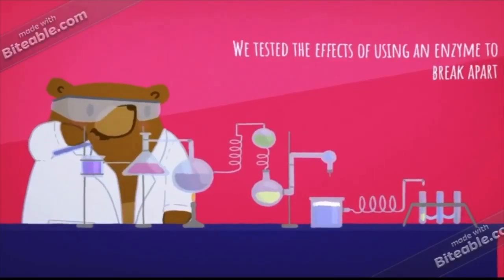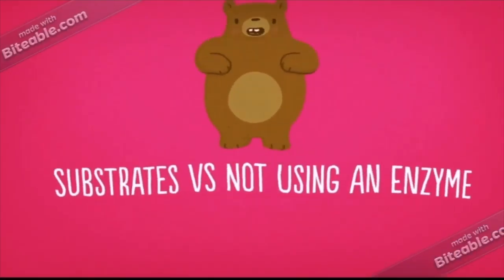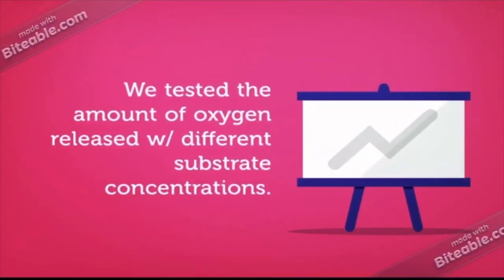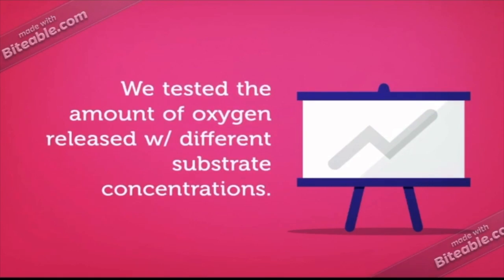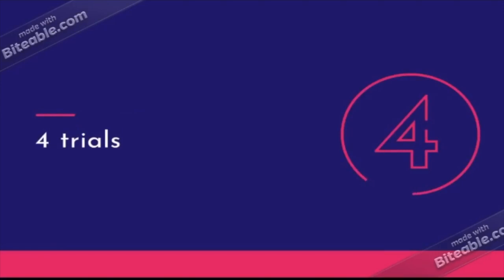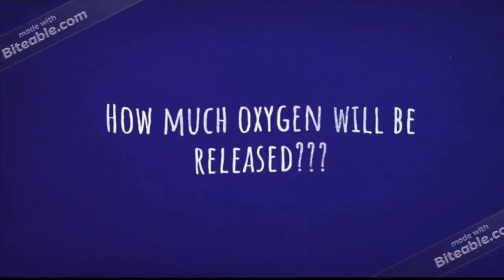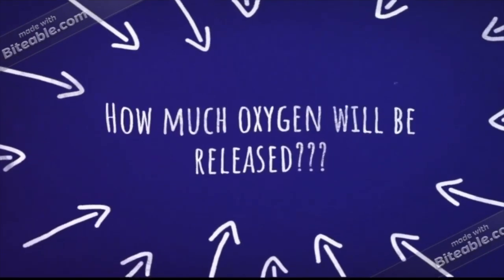In class, we did an experiment where we tested the effects of using an enzyme to break apart substrates versus not using an enzyme. We took our own spin on the lab to test the amount of oxygen released with different substrate concentrations. We performed 4 trials using 4 different hydrogen peroxide concentrations to test how much oxygen would be released with each concentration.